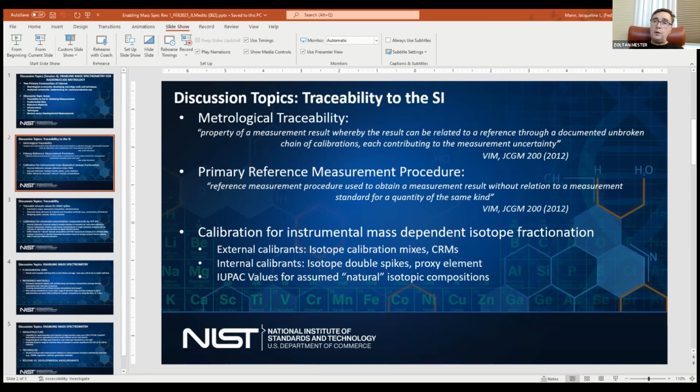If the question the users are posing is where your sample is in this natural distribution space, the isotopic profile distribution, then you cannot calibrate against the average distribution on Earth, obviously, because the spread on that would simply be too large.